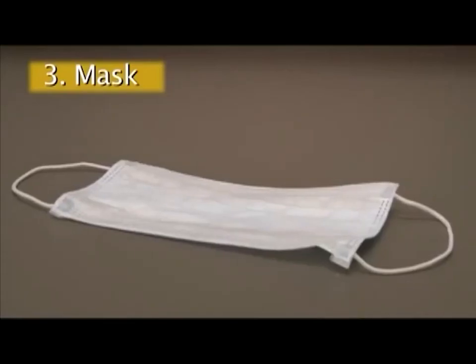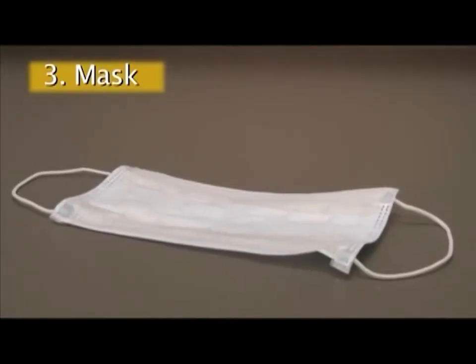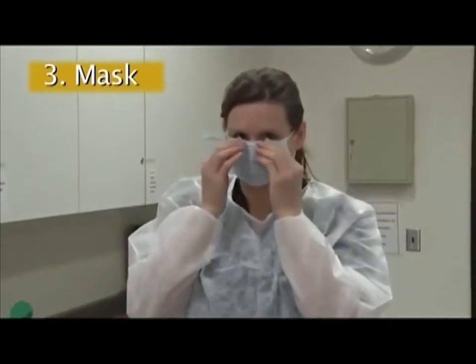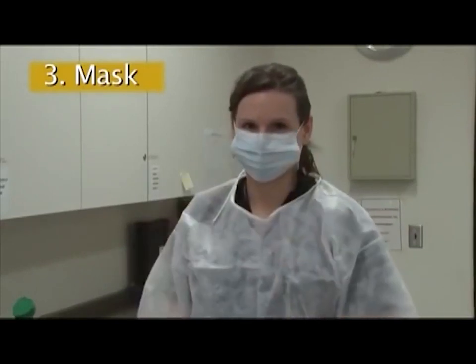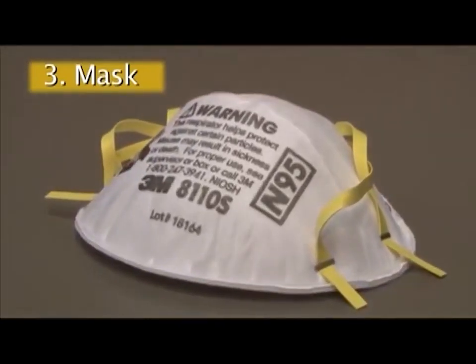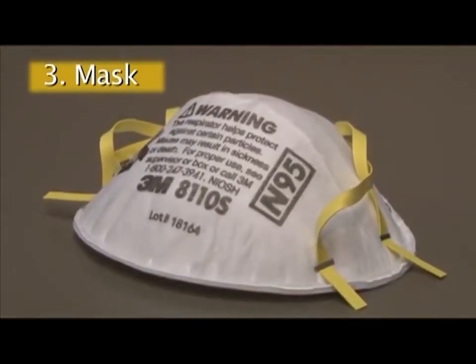There are various kinds of masks and respirators, but each is worn in a similar fashion. Medical face masks are loose-fitting and are designed to filter some of the wearer's exhaled organisms to reduce exposure to others. Respirators are tight-fitting and require certification from the National Institute for Occupational Safety and Health. They are designed to filter inhaled organisms to reduce exposure to the wearer.